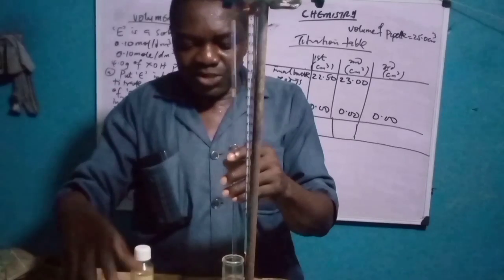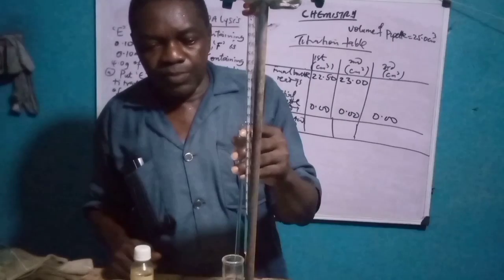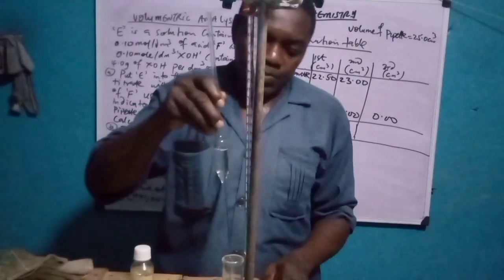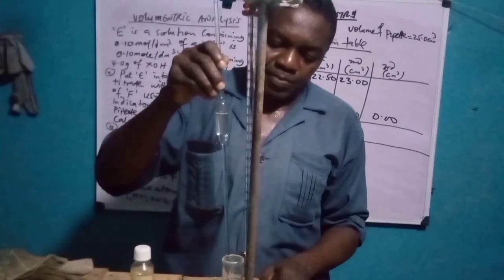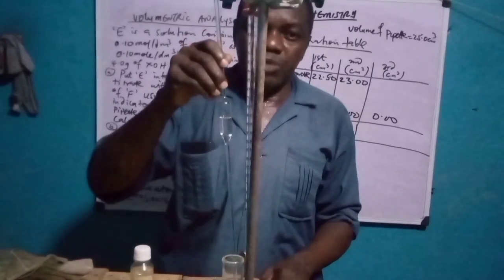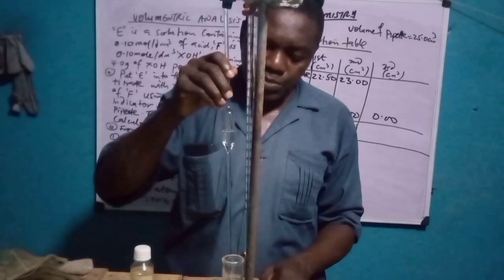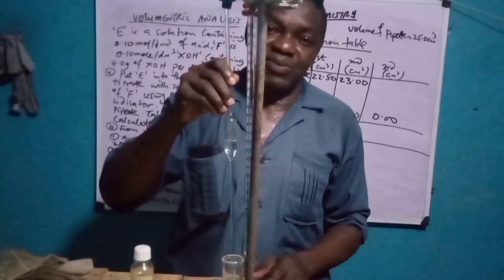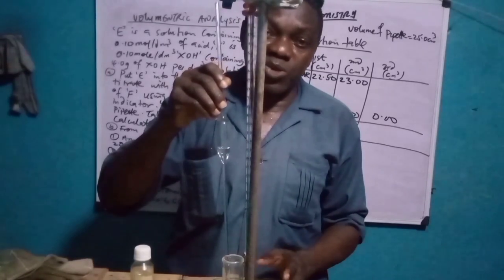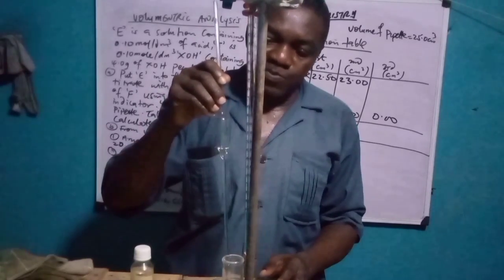So this is the last titration. I'll give you 4 precautions. In my first video, I think there are more than that. It's still draining through. Remember, you must not blow the last drop. Don't ever forget that. I think that makes it 5. Usually they are asking you 4, 2. They hardly ask 6, 5. Just say state 2 precautions. Very rare they say state 4, but no minimum of 4. They are simple now. There's nothing in it, so that you can do well.